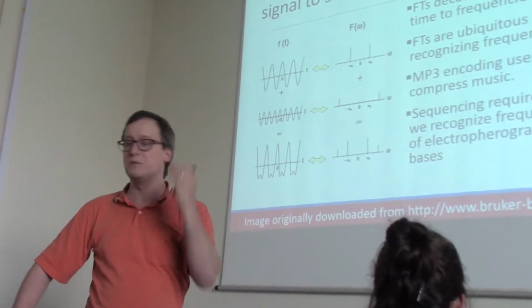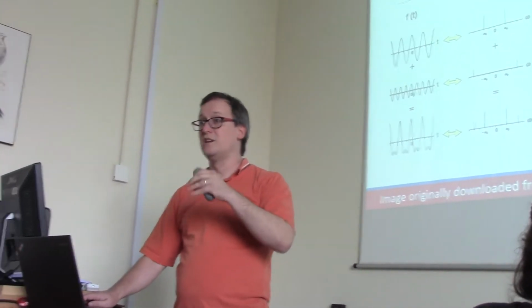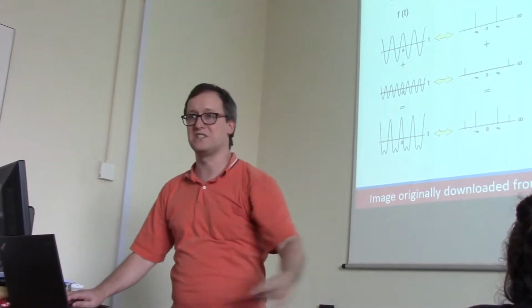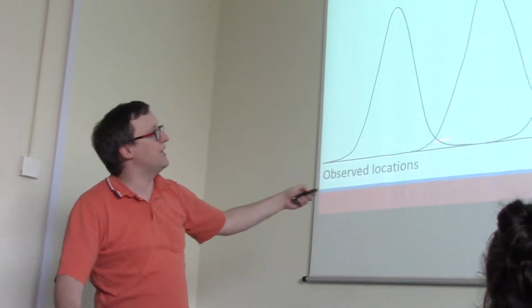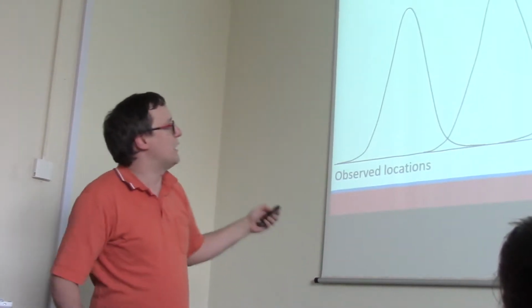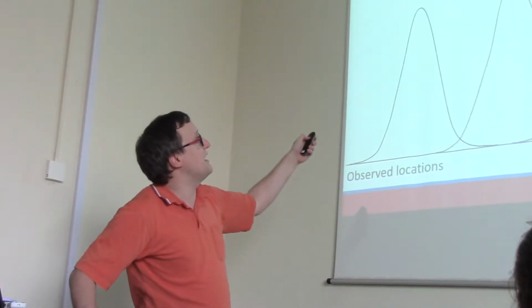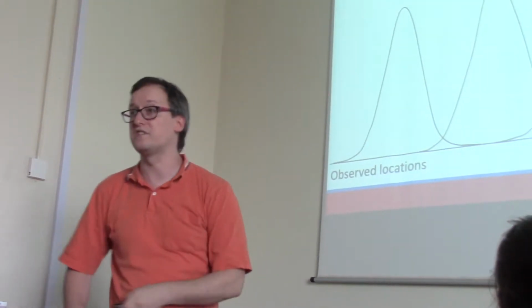So I mentioned just a moment ago that we want to be able to match peaks to the characteristic frequency of the electropherogram. The electropherogram being this pattern of fluorescent intensity with time. So I want you to imagine that we have a sort of problematic space in our electropherogram. Now, at this point, I'm not separating out colors, one to each of the dyes that we're using. But I have a set of predicted locations and a predicted period for this as well.